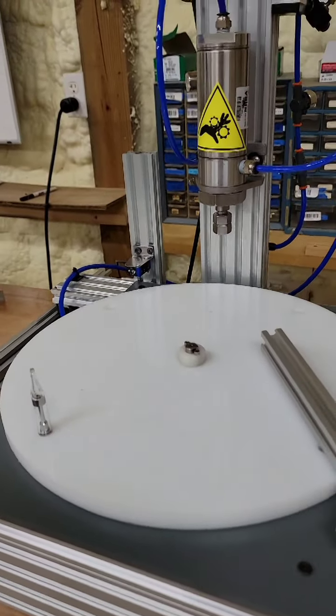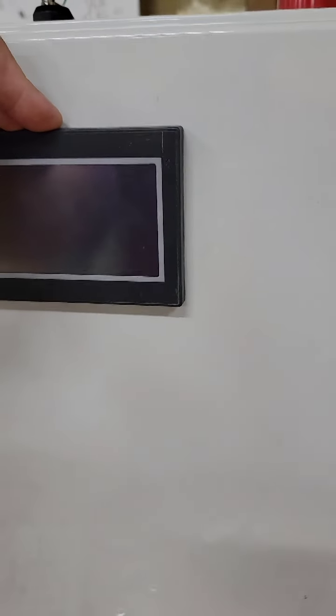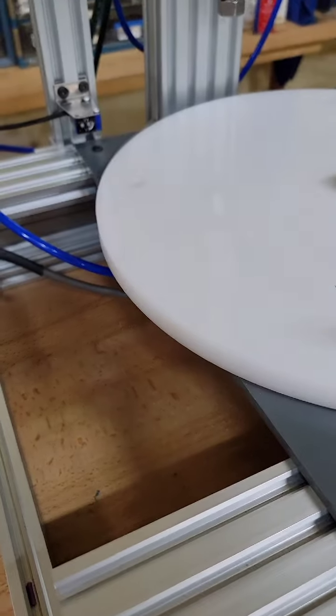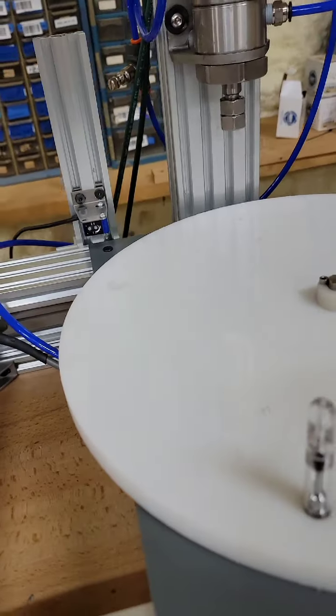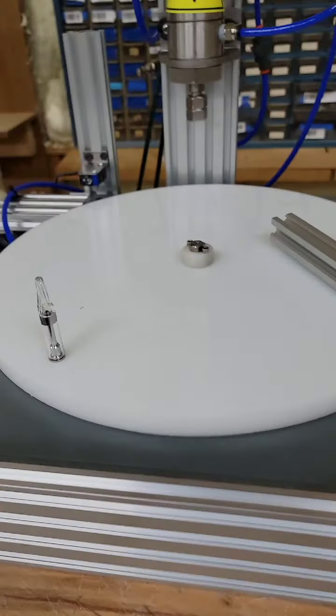Okay guys, so this guy's ready to go. The HMI I'm thinking to leave off, we can maybe - I'm going to leave it in there just in case you guys did want to add a filler or something later on. You can. And then we could maybe add some fill variables and stuff like that on a syringe or something like that.